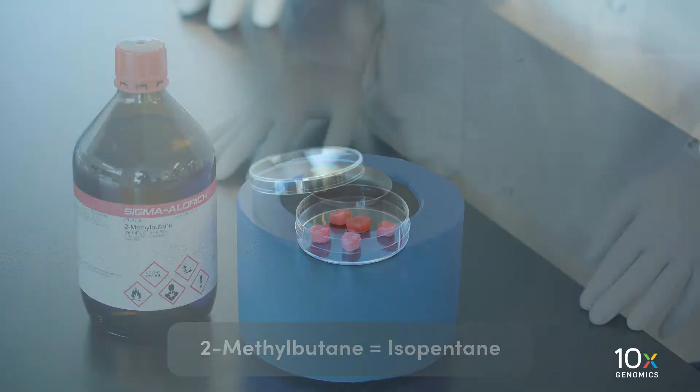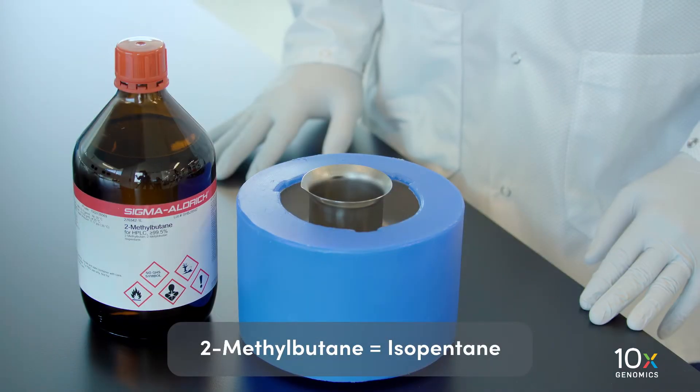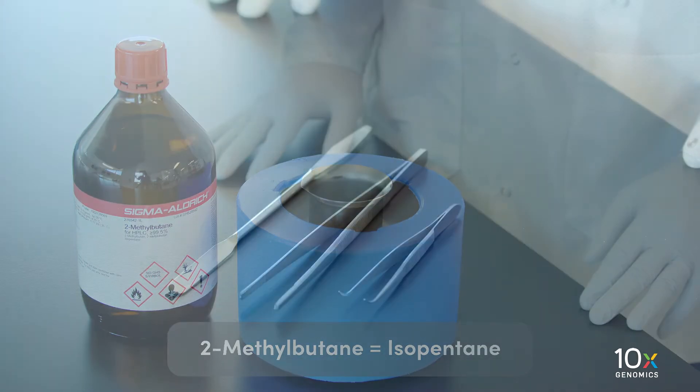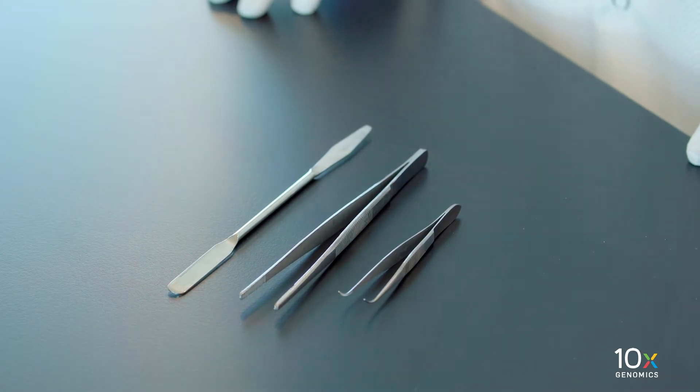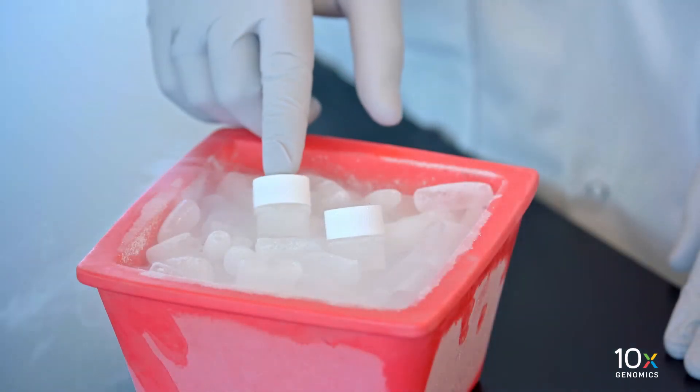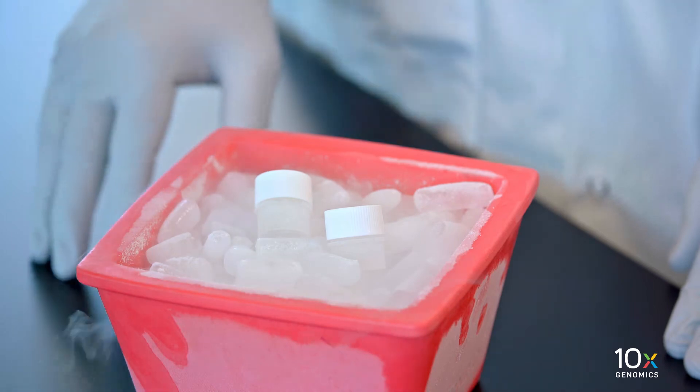We are ready to snap freeze our fresh tissue sample. We have the fresh tissue, materials to make an isopentane and liquid nitrogen bath, a forcep or spatula, a pre-cooled Wheaton cryo elite cryovial, and dry ice.